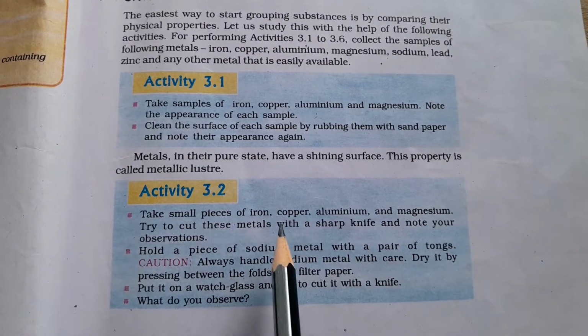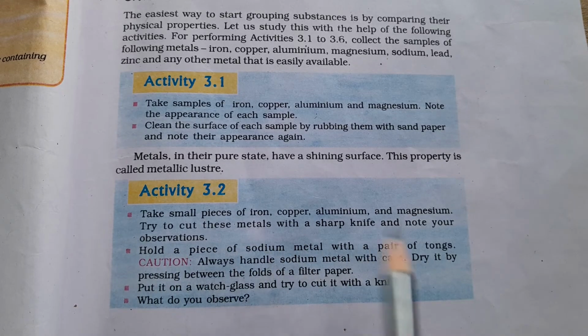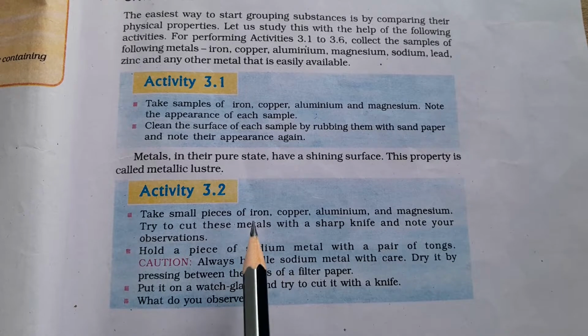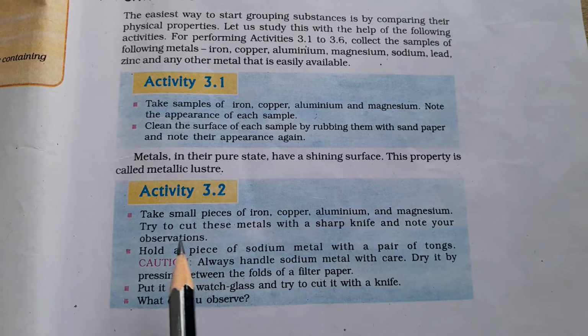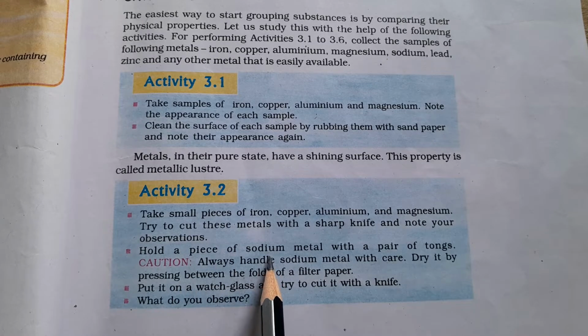Take a small piece of iron, copper, aluminum and magnesium. Try to cut these metals with a sharp knife and note your observation. Then hold a piece of sodium metal with a pair of tongs. Always take this caution: handle sodium metal with care. Dry it by pressing between the folds of a filter paper. So first we take iron, copper, magnesium and try to cut them with the knife. Then we take a piece of sodium and make it dry by folding in a filter paper. Put it in a watch glass and try to cut it with a knife.